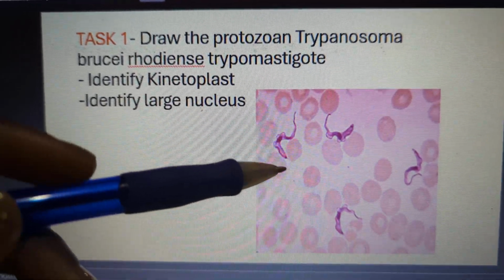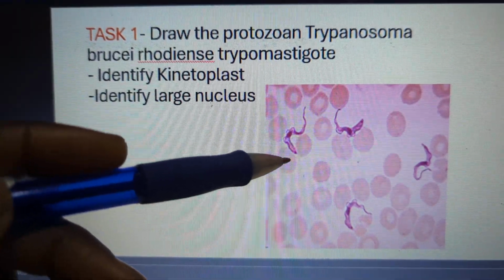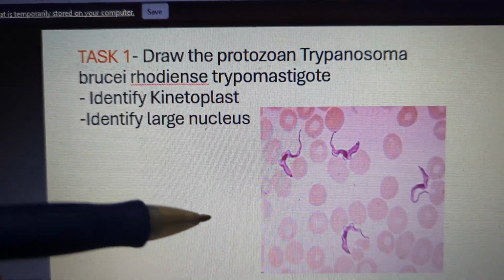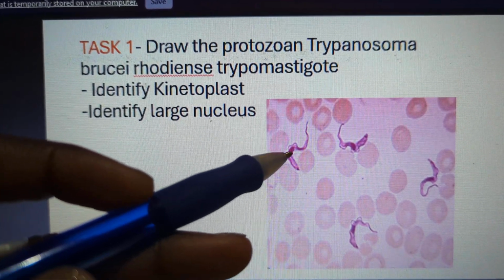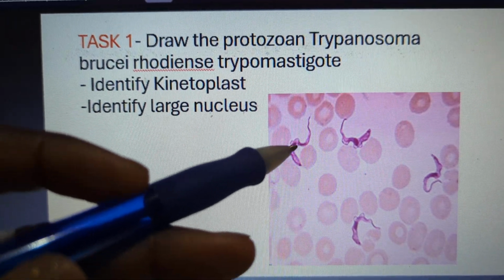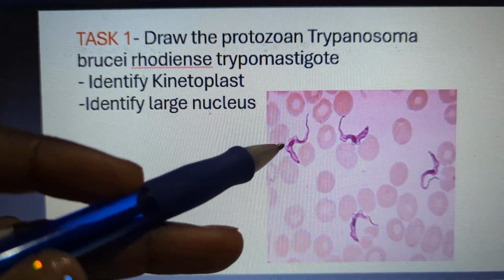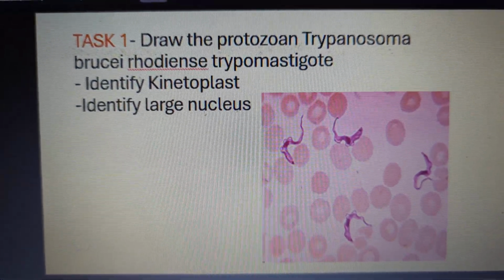And also comment on the Giemsa color. This is a Giemsa-stained slide, so it's a very unique and important staining option in parasitology. You have some nice red-purple coming out in the nuclear material. The kinetoplast is mitochondrial DNA associated there, and then you have the main genetic material in the nucleus. There's a red-purple because of Giemsa, so pay attention to that as well.